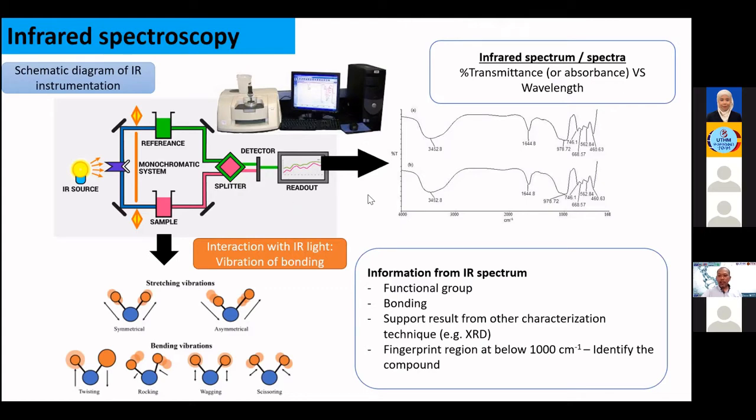So if you are in the engineering field and you want to characterize the material using IR spectrum, because you have this kind of instrument in your facility but you do not have the fundamentals, it is better to learn a little bit of the fundamentals of IR before you just take the result, take the spectrum, and put it in your thesis, in a paper, a conference paper, or a presentation. Because maybe you will give wrong information, or interpret the IR wrongly.